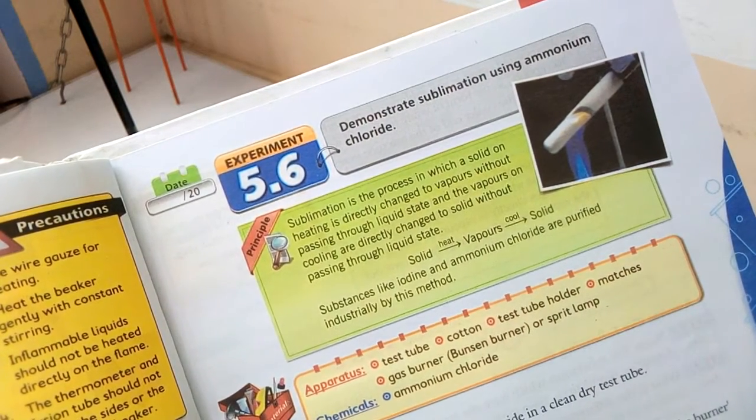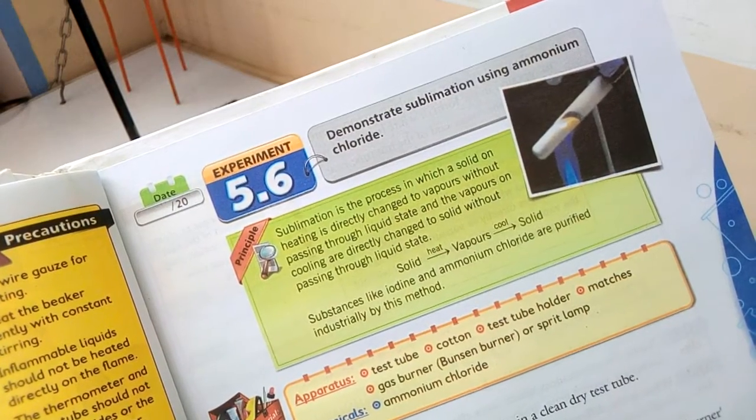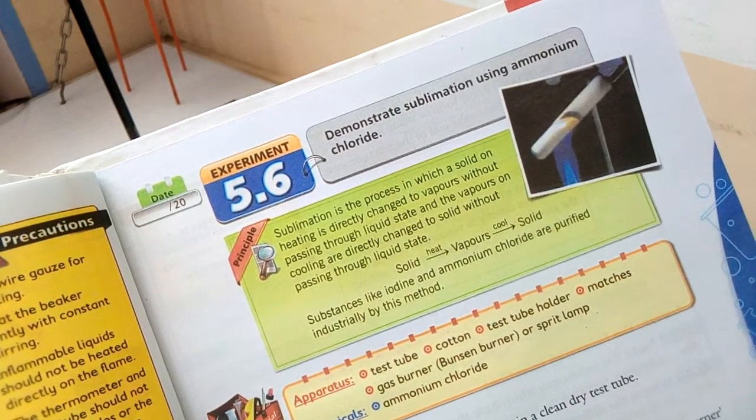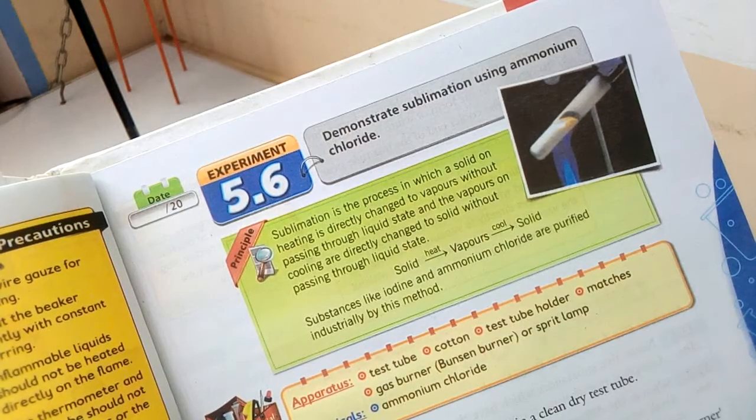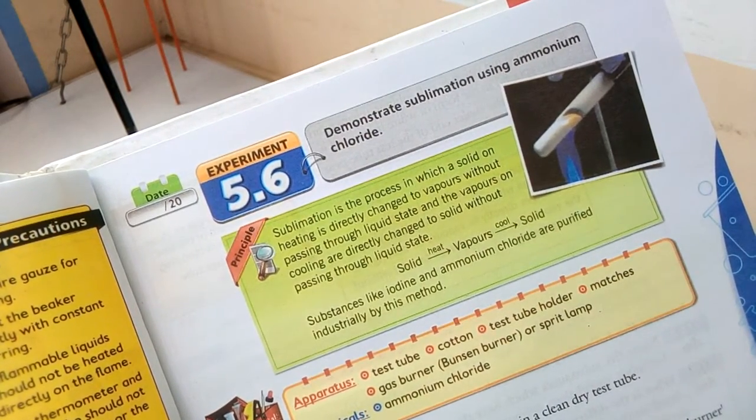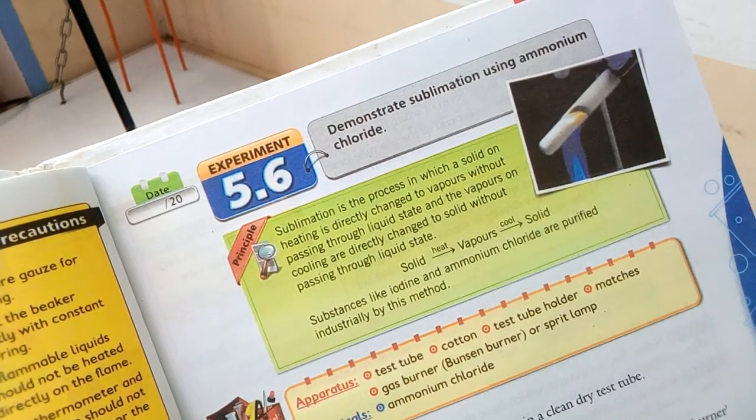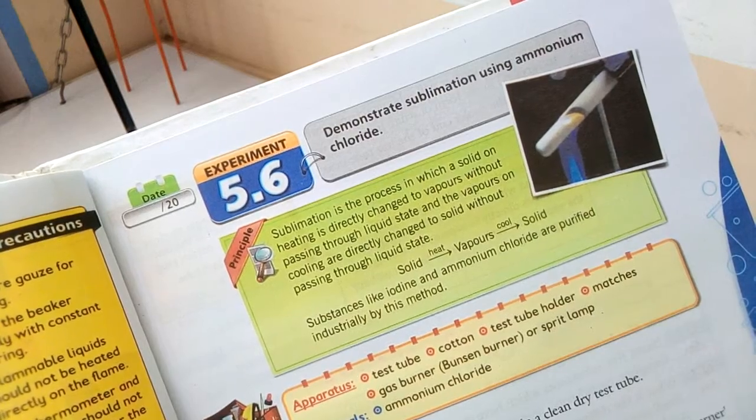Assalamu alaikum dear students, today we will perform experiment number 5.6 to demonstrate sublimation using ammonium chloride. As you know, sublimation is the process in which a solid is directly changed to vapor on heating without passing through the liquid state.